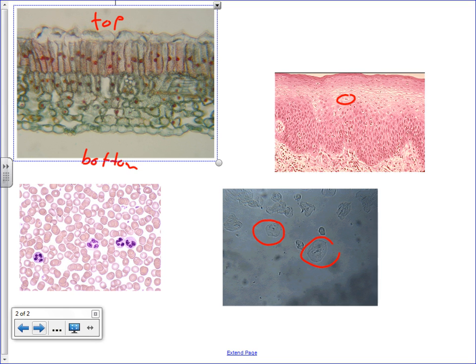Are there any questions on that? So we have about 50 minutes to get all of these things viewed, get your pictures snapped of them, and then the lab report will be next week. I'll figure out when in a minute.